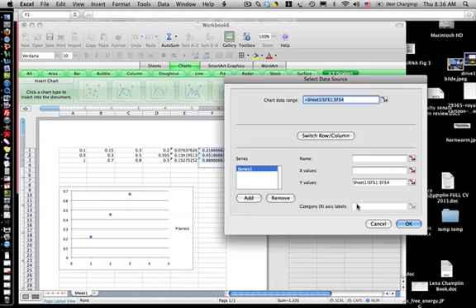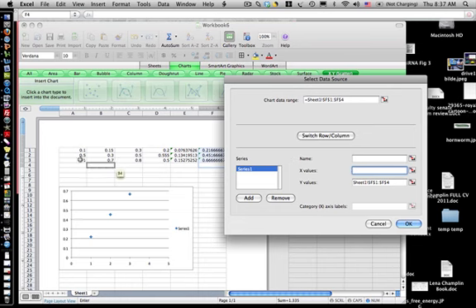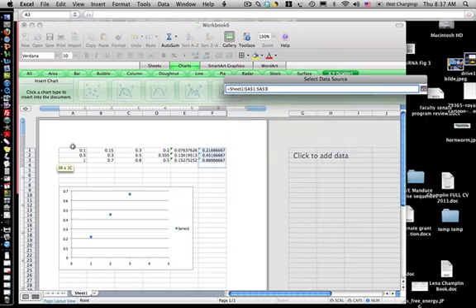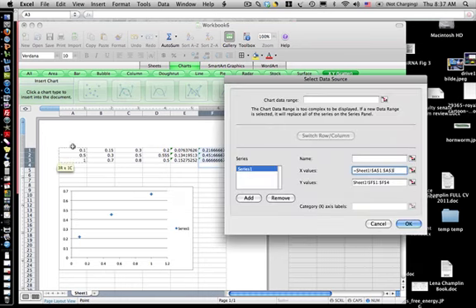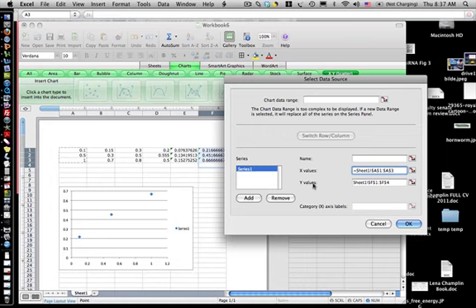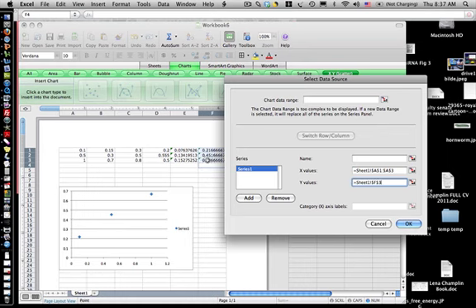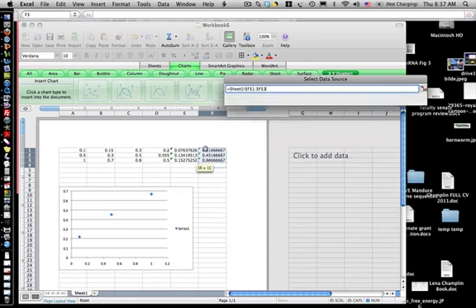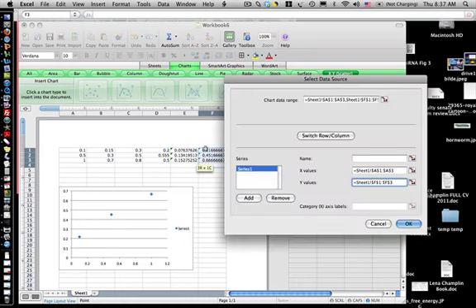And so I can just put this here like this, and for the x values I can go over to the data and I can highlight that and get Excel to use that for the x data. If it was the wrong y data, I could just erase this and go to the spreadsheet and tell it which ones to label.